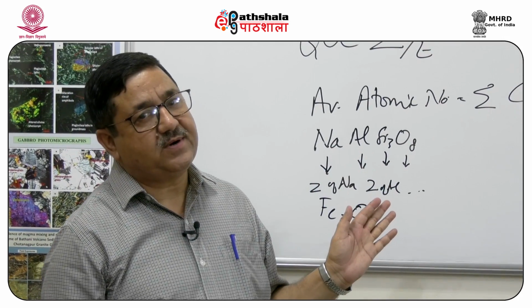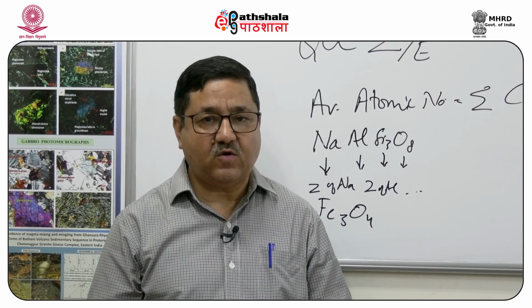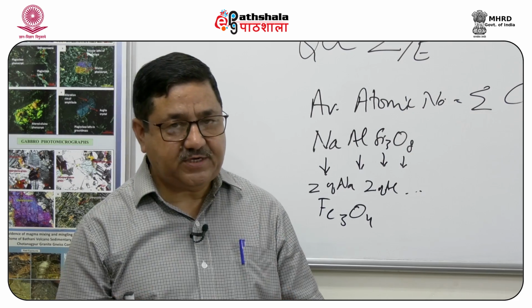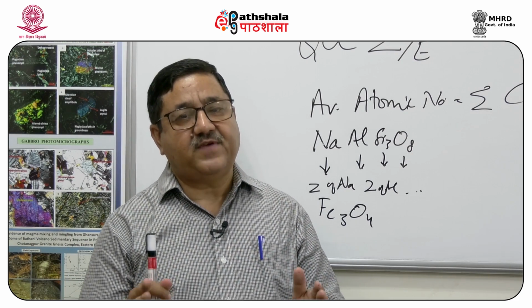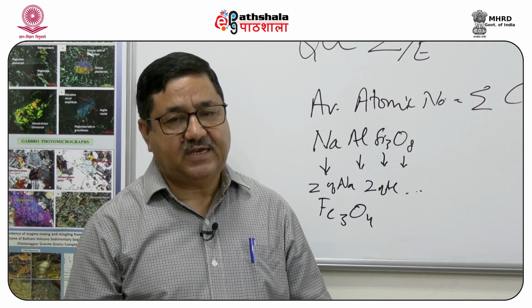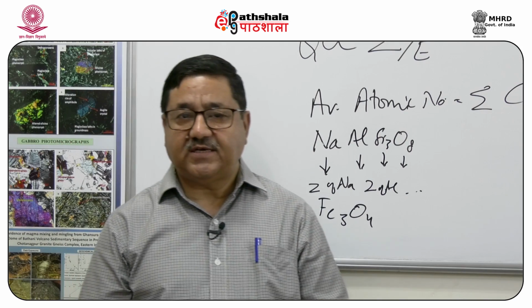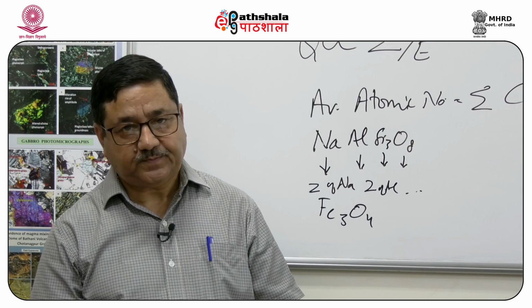So, higher atomic number elements, minerals and compounds have a higher backscattering coefficient, and it is a very useful tool to distinguish petrologically different phases and variation in composition within the different phases. This is one important microscopy function which is obtained through the scanning electron microscope.